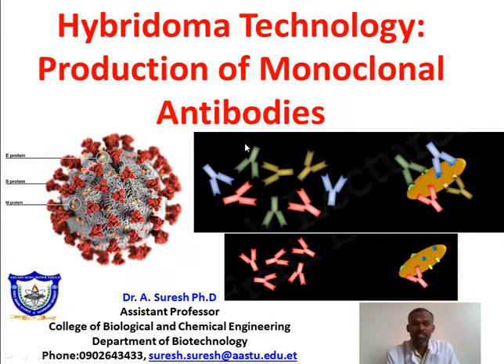Hello everyone. Today in this video I'm going to teach you hybridoma technology for the production of monoclonal antibodies. Monoclonal antibodies are very important for disease diagnosis as well as the cure of disease.